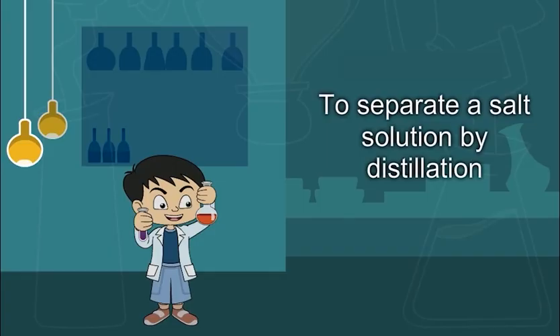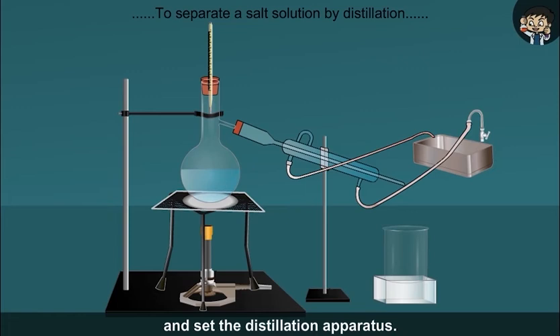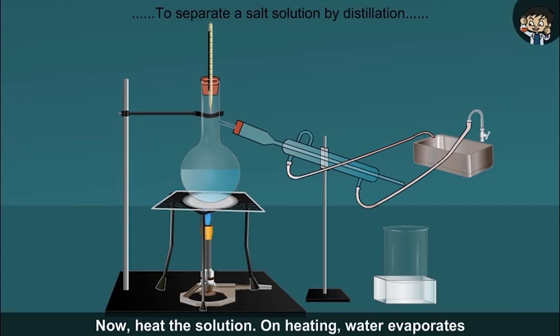To separate a salt solution by distillation. Take some salt water in a round bottom flask and set the distillation apparatus. Heat the solution. On heating, water evaporates and rises up in the form of vapour.